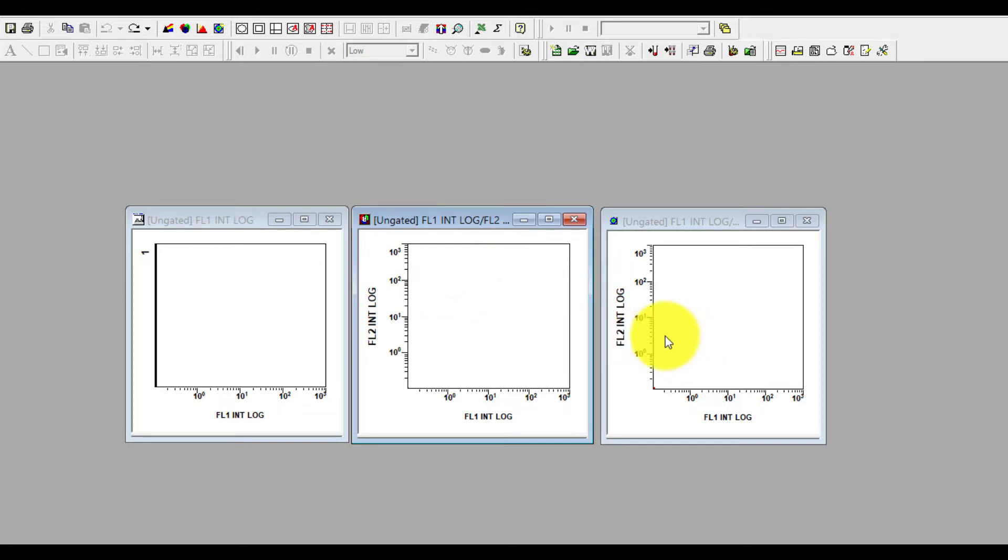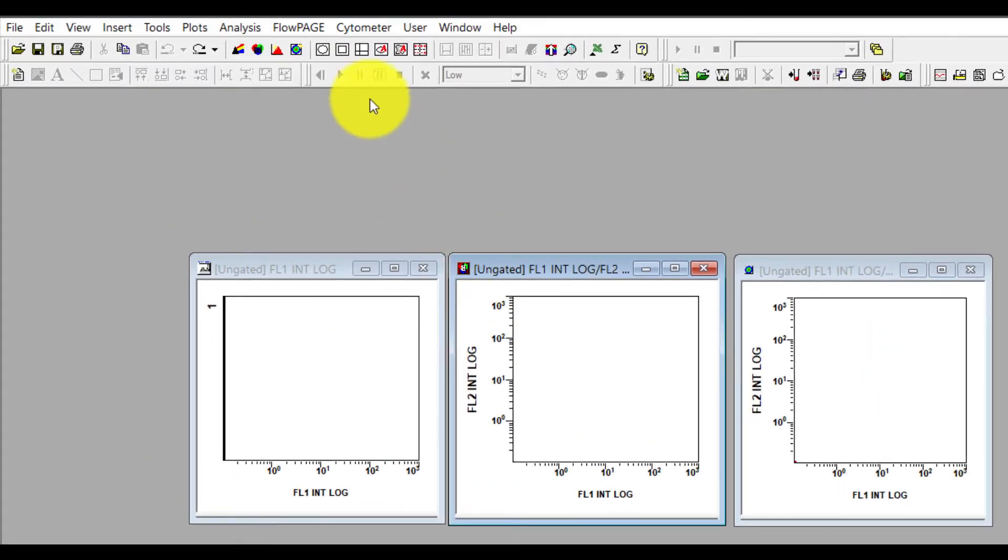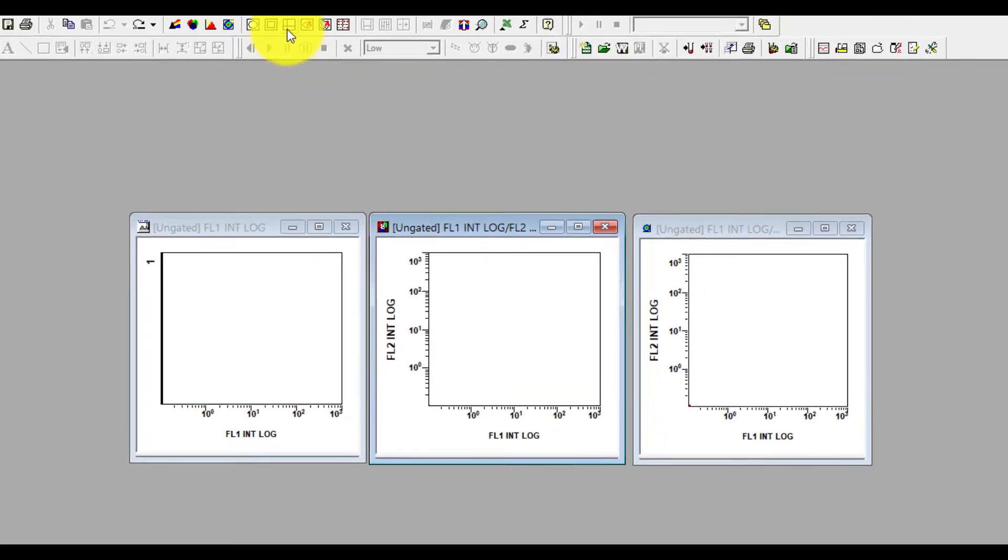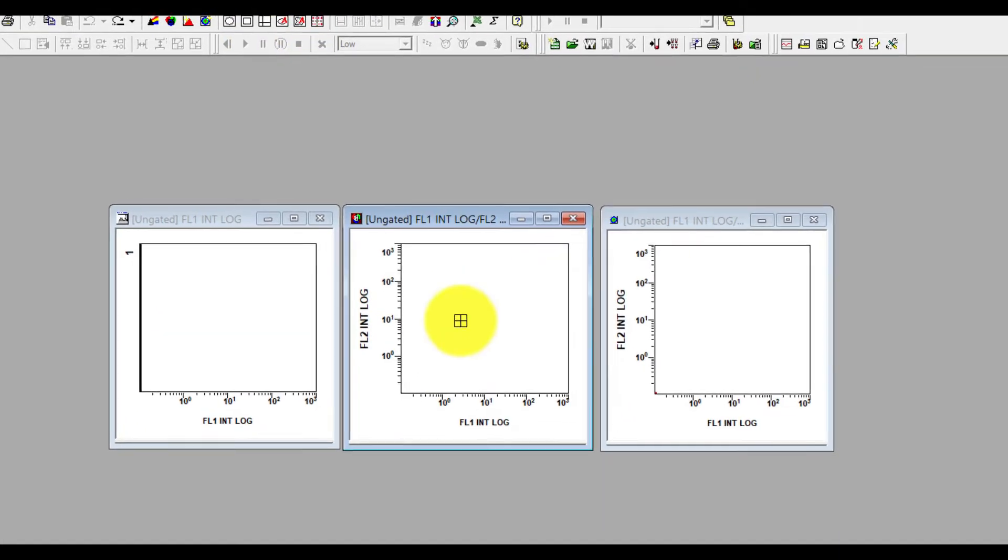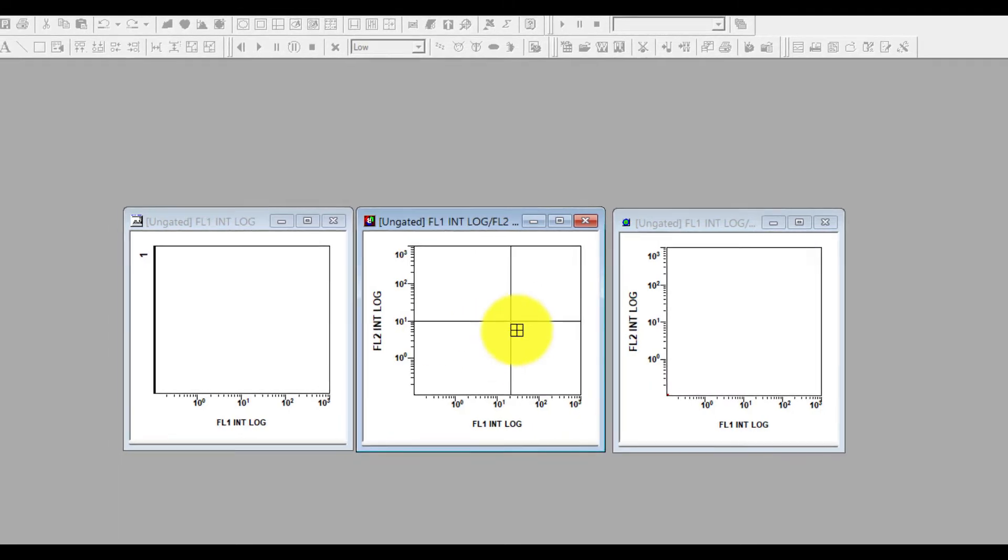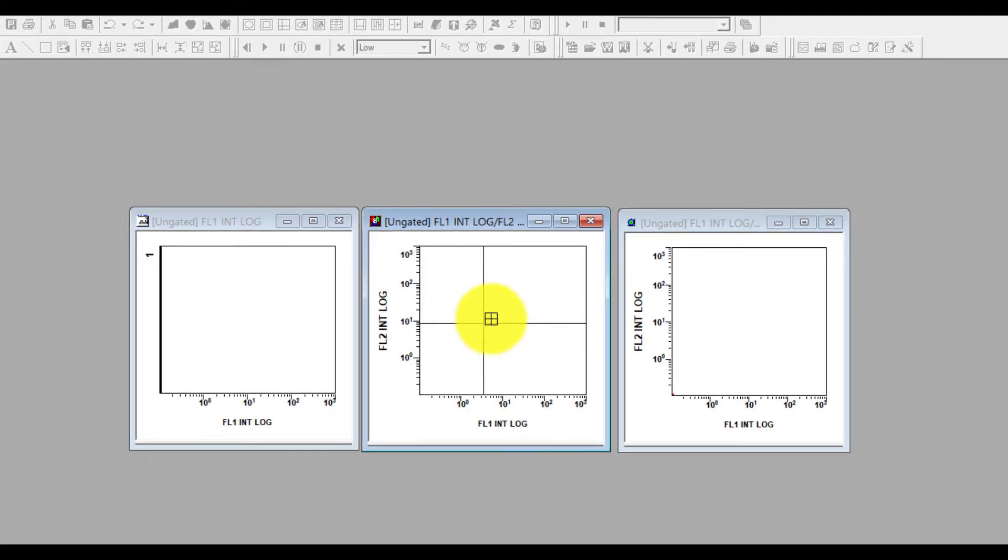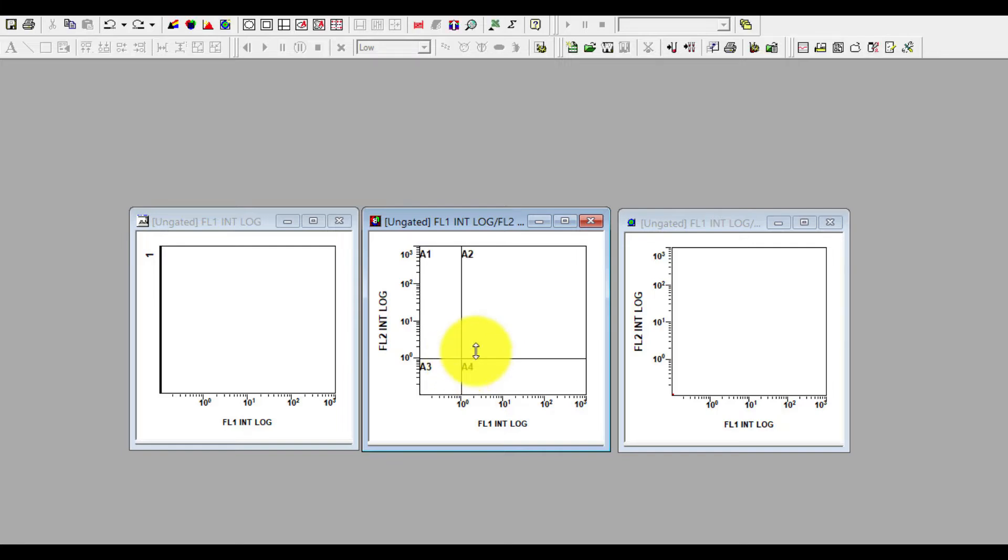The quadrant can be made in dot plot. Go to this icon, quadrant, click on it, bring the mouse, drag here, click inside and you can freely move it. Ideally x-axis to y-axis should be at 10 to the power 0, but you can adjust later according to your cell population. Once you click it, automatically the software will make four quadrants: A1, A2, A3 and A4.